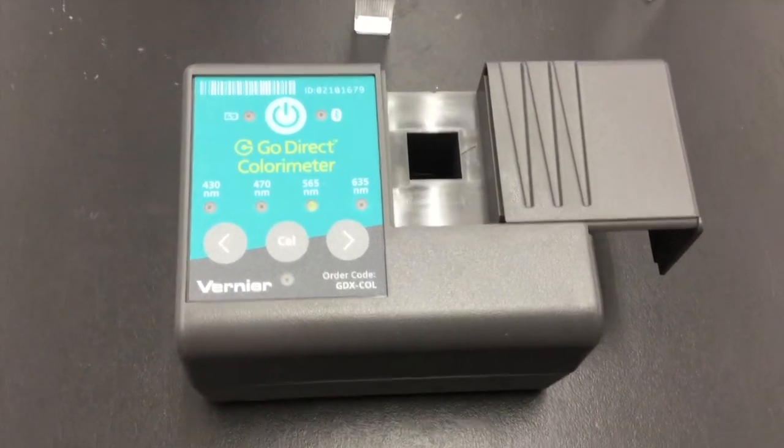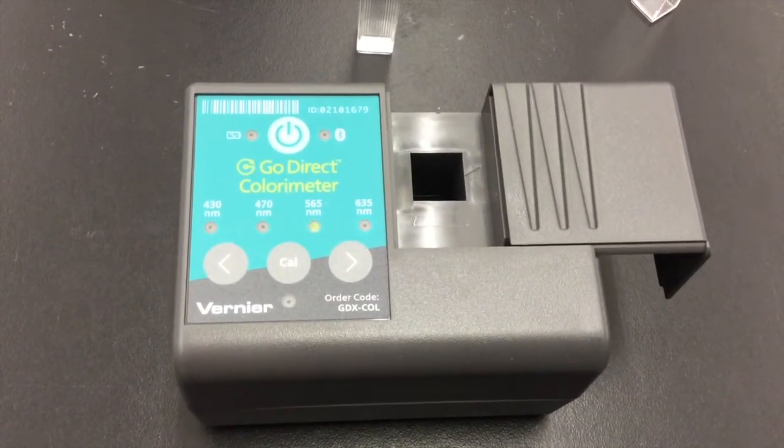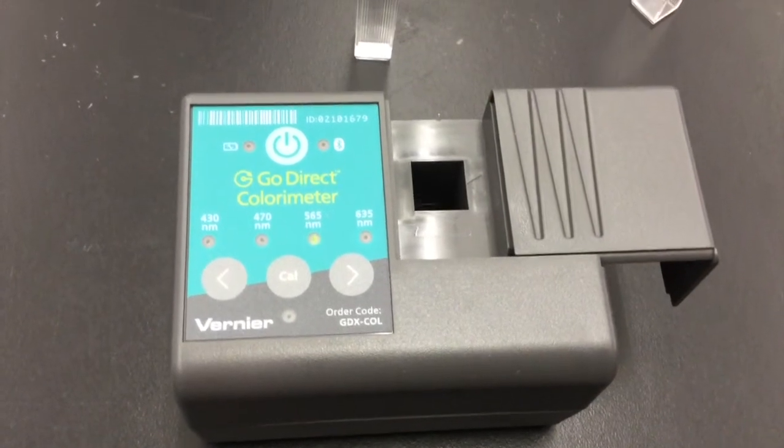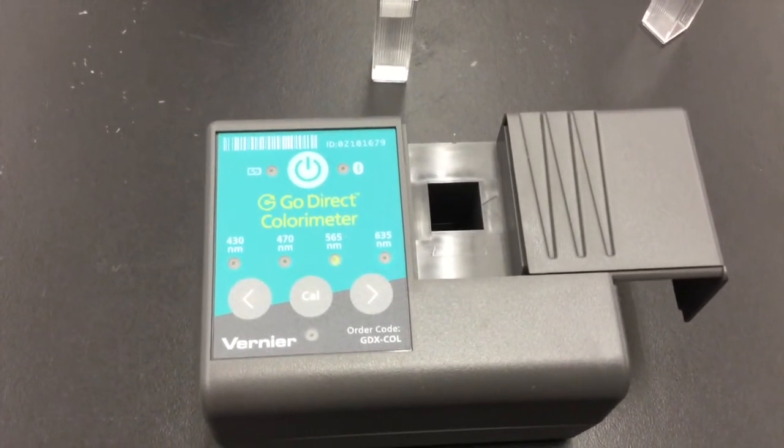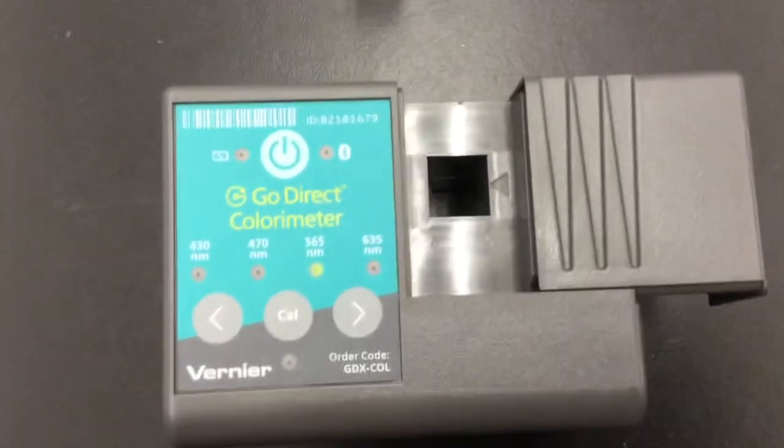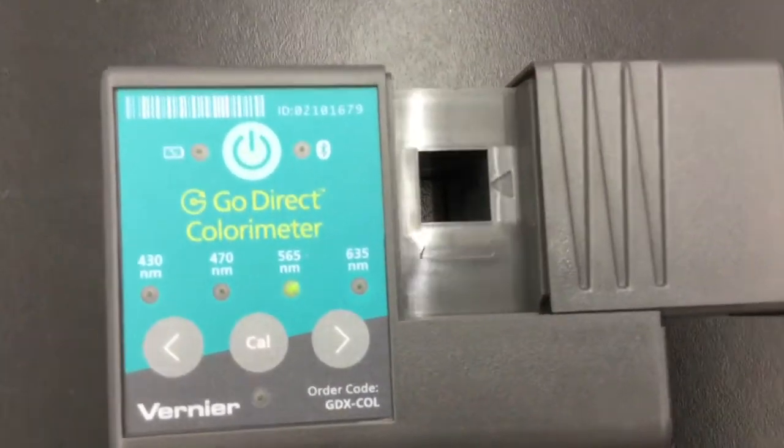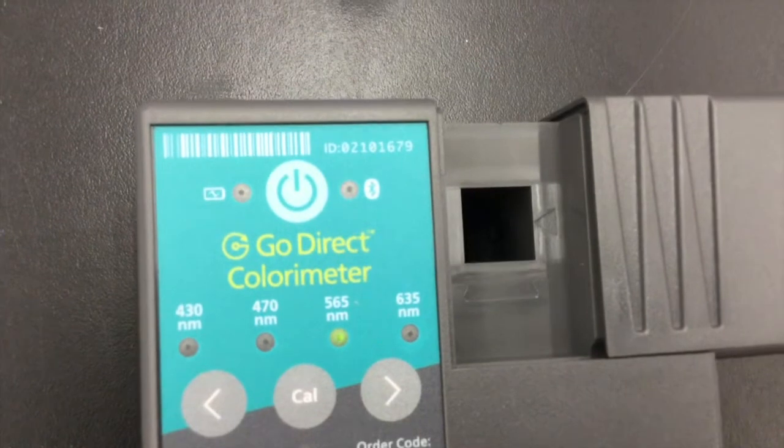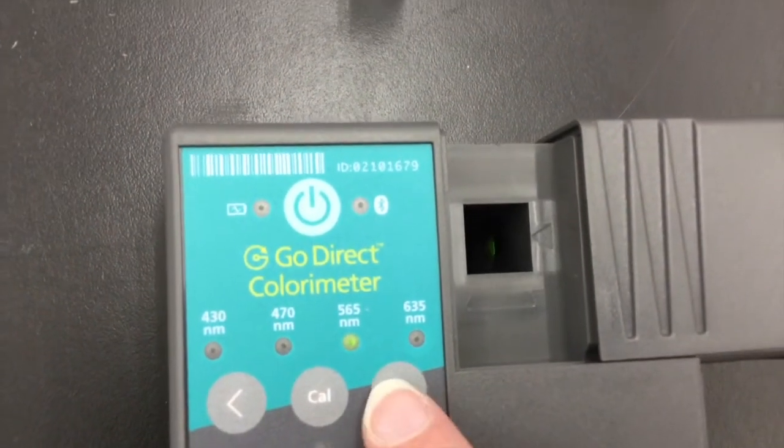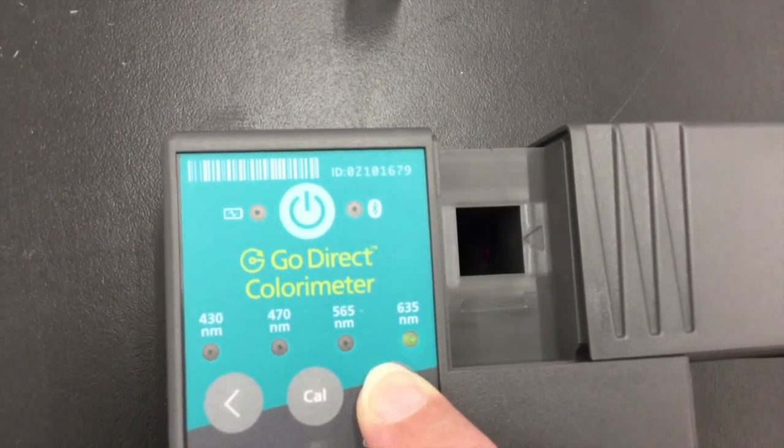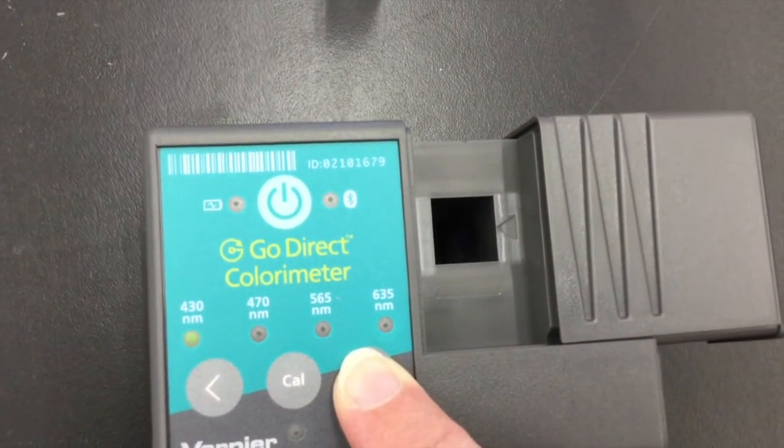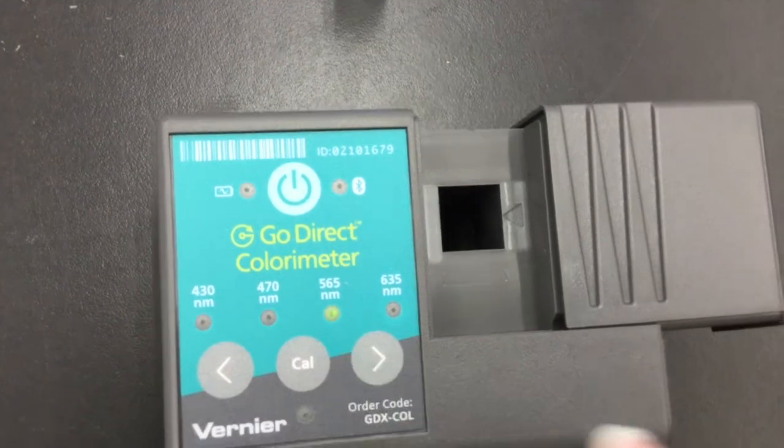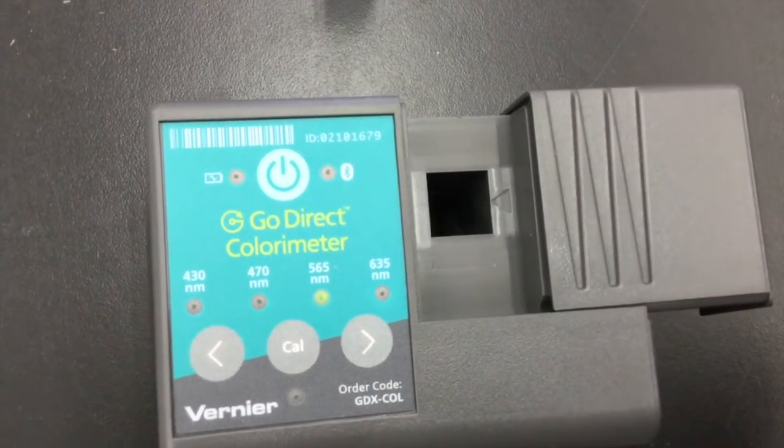These colorimeters that we will use are a little bit different from the ones in the video, but the setup is very similar. So you are first going to need to calibrate it. Something I want you to notice is that if you look inside, you should be able to see the color of the light that is coming through. And as you change the color on the wavelength, we should see a different color of light. We are going to set it to the 565.